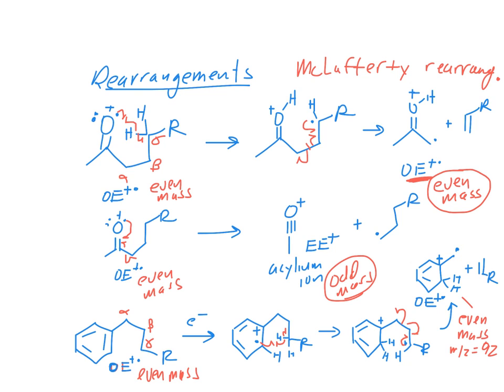He always mentions the tropylium line. That's like 91. It's 91. Okay. Does this specific fragment have a name? Not that I know of. Okay.